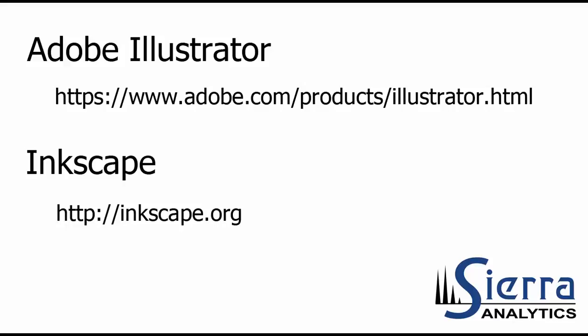You can scale your images however you like. You can change things around. And then in all of those programs, you can save it as a PNG or a JPEG or whatever format you need. So that's all.